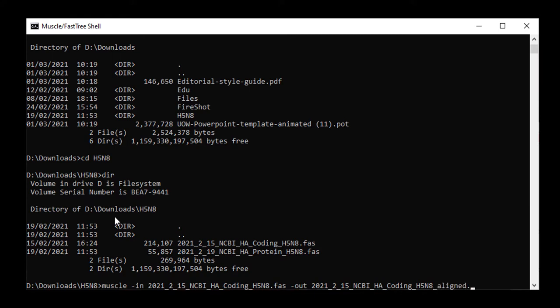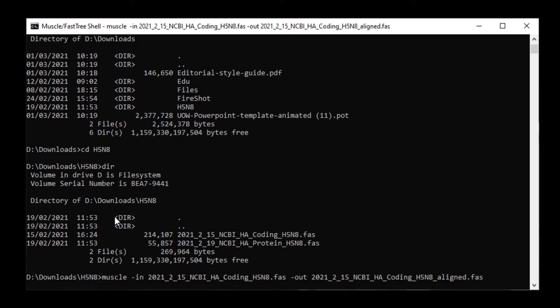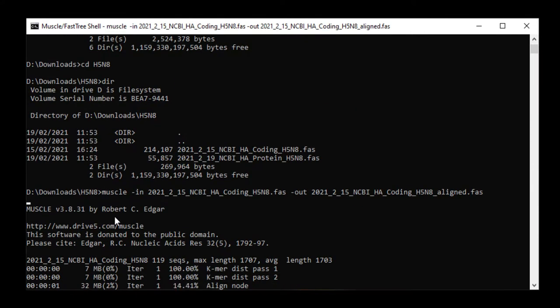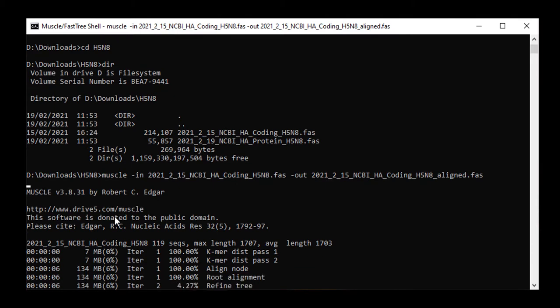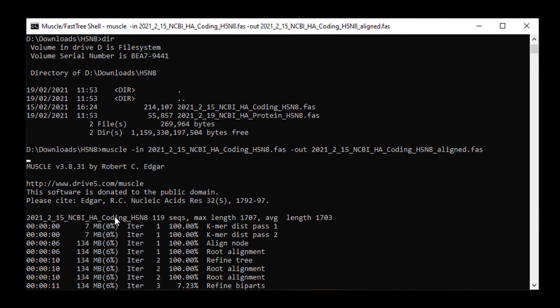I use the same process with the output file name, but I don't want to use the same name for the input and output file because otherwise it would overwrite it. So I add aligned to the file name. I could have added aligned muscle to be more specific. It's still a fasta format file, so use the fasta suffix. Muscle then carries out the alignment.